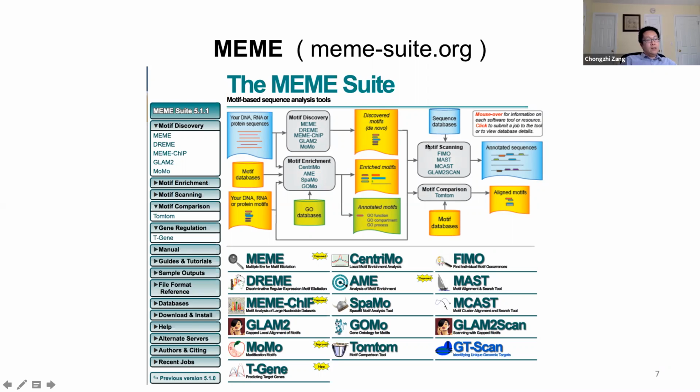we can compare the identified de novo motifs with a database which contains many known motifs, for known transcription factors. In that case, we can compare the motifs we identified from our data with the known motifs in the database. It will tell you which of the de novo identified motifs from our data belong to which transcription factor. So we can find the results as an aligned or matched motif with the known information.